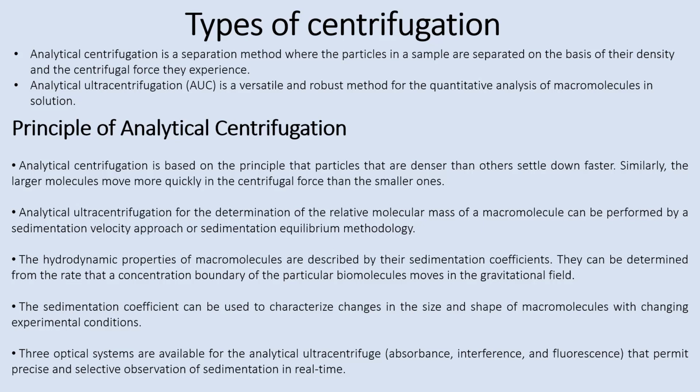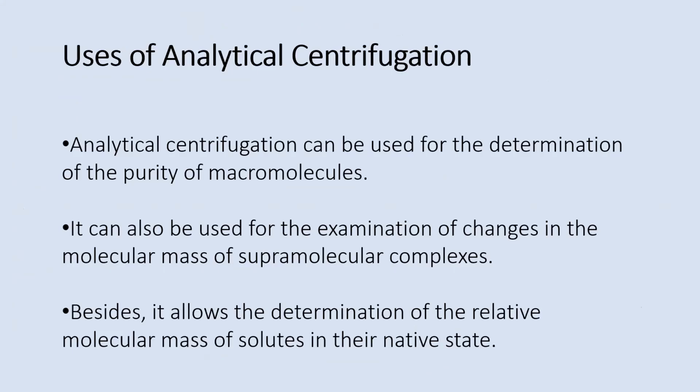If you're separating, say, protein A, and protein A has a certain absorbance at a certain wavelength, then because of these techniques, which can measure absorbance as the centrifugation is happening, you can keep getting data that the absorbance in the supernatant is right now very high at a particular wavelength. It means that protein A is still in the supernatant. But as the absorbance of the supernatant starts decreasing, it indicates that the pellet is having the particular biomolecule A. These are certain developments that keep happening in this area.